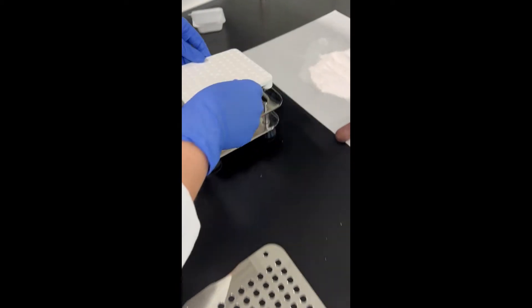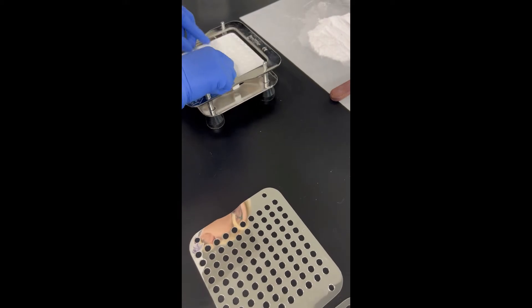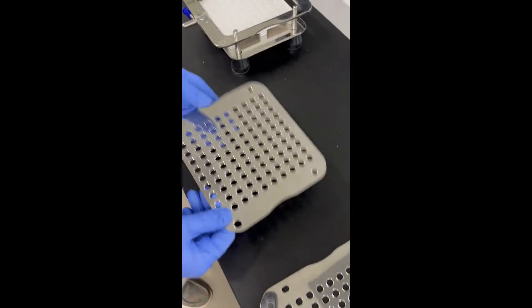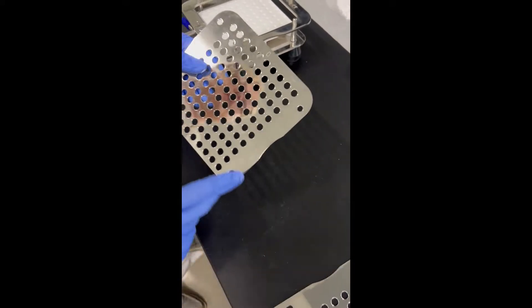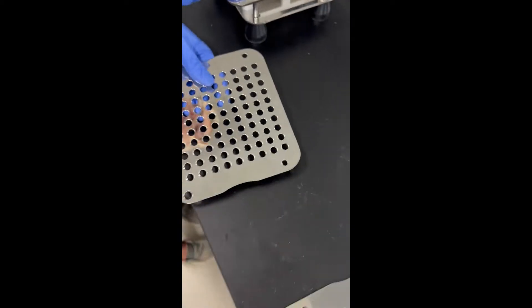This zero is going to be at the top, and they're going to go in these two little holes. That should just perfectly fit in there. And then you're also going to have these three little plates — they are labeled A, B, and C — so that's the order you're going to put them on.